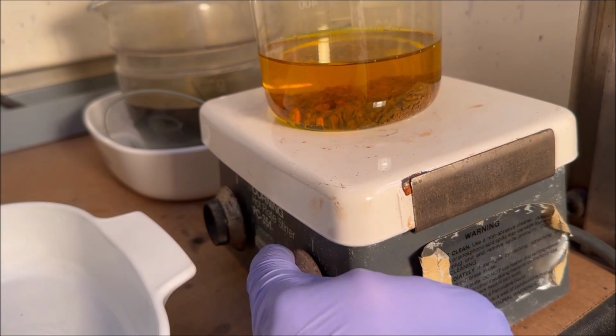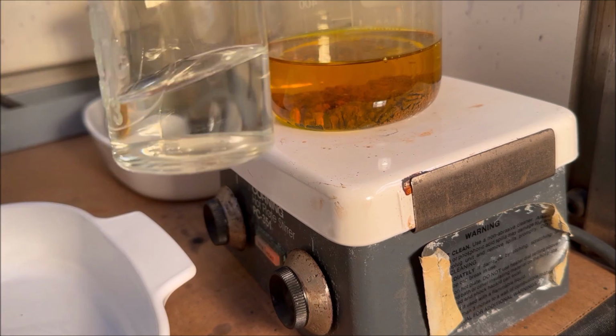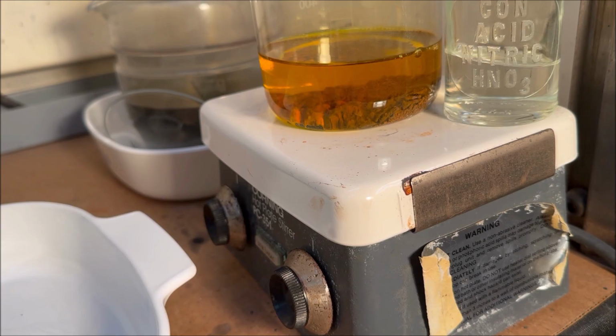So now I'll add some heat, and we'll start adding doses of nitric acid in here. Put it on time lapse now, and we're going to watch the gold dissolve and hopefully get that lead shot to dissolve in there too.